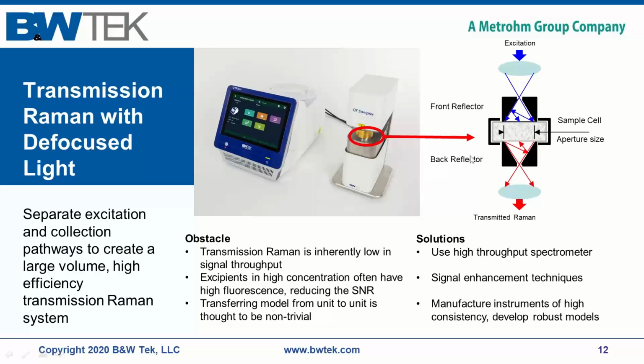So the question is then that I stated that we transferred the method and then we validated it with additional validation samples on additional instrument. Well, that would be good practice actually to validate a method once you've transferred it. And in order to validate it on the other instrument, then the samples need to be measured on that instrument.